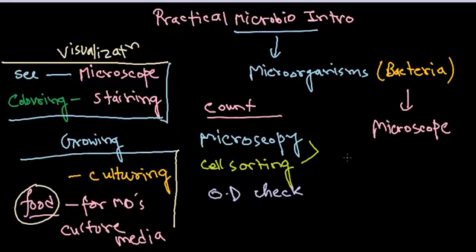So for that reason, what you need to do, you need to sterilize certain things before starting this process. You need to sterilize each and every material that is going to contact directly with your culture media or the microorganism, or your desired microorganism, right? So you need to sterilize those things. So sterilization, I must write here, sterilization is another very important stage for microbiology and any kind of culturing process, whether it's a microbiology culture or cell culture of animal cells and whatever.